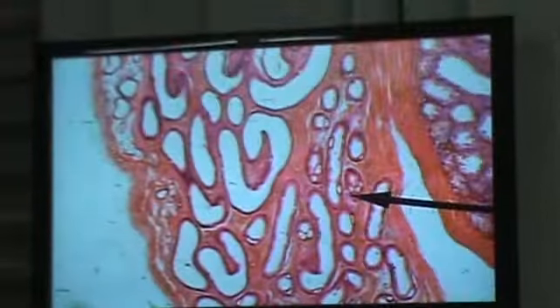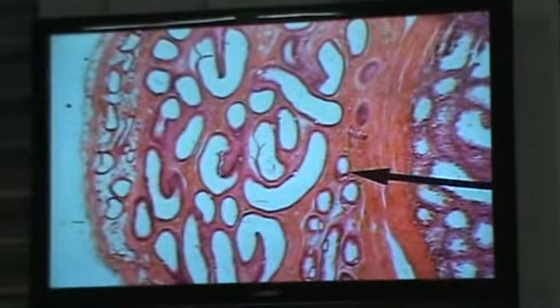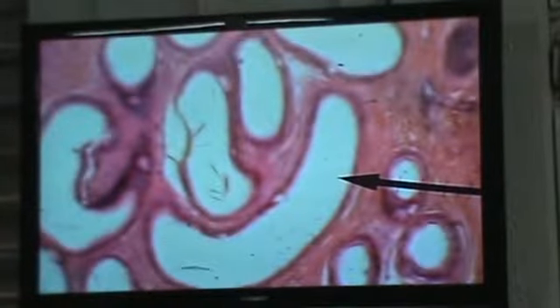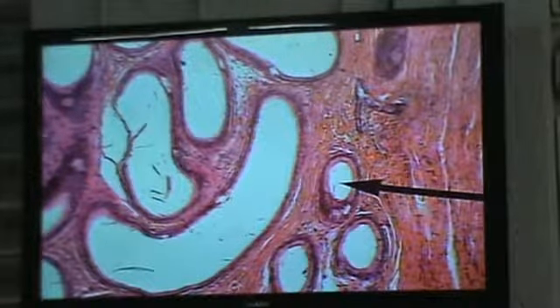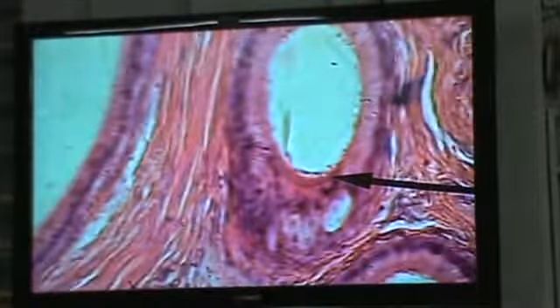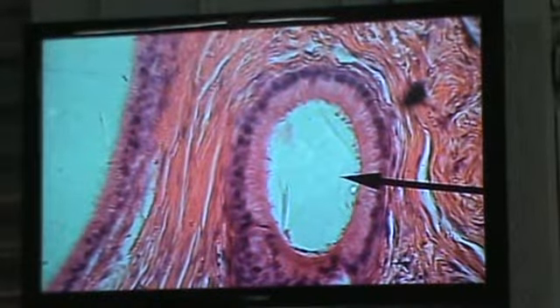So we want some very small ductuli efferentes. Okay, this little guy here, just look at him. Very small again. Very, very small tubules. Yeah, that's it. So you have a very small little guy here. Alright, see the ones beside it? The ones beside are much larger.